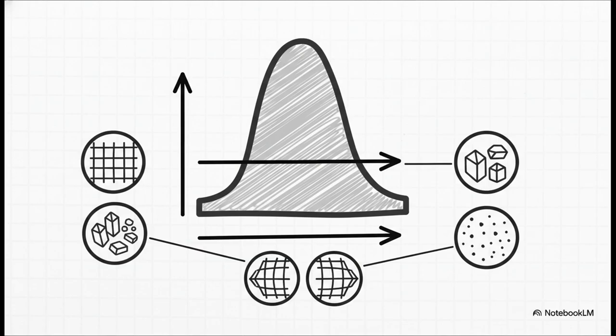Where a peak shows up on the graph, its position tells you about the material's chemical makeup and whether it's under stress, which could cause a device to fail. How tall the peak is, its intensity, reveals how well-ordered the crystal is. And even how wide the peak is contains a ton of information, giving you clues about the size of individual crystal grains, which can affect a material's strength.